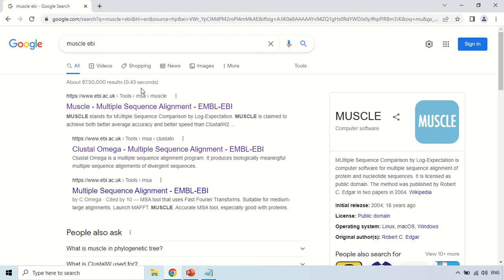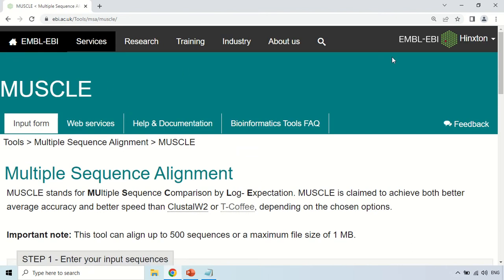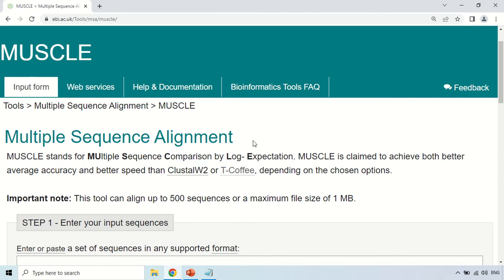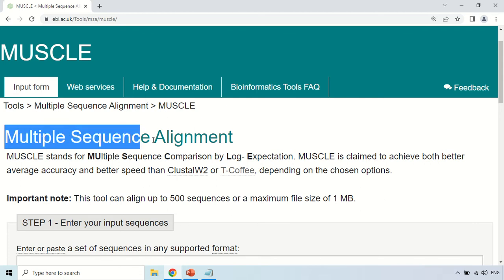The first website which starts with www.ebi.ac.uk — just click that website. This is the home page of the MUSCLE tool. MUSCLE stands for Multiple Sequence Comparison by Log Expectation. This is the full form of MUSCLE, and it is a very important tool used for performing multiple sequence alignment.